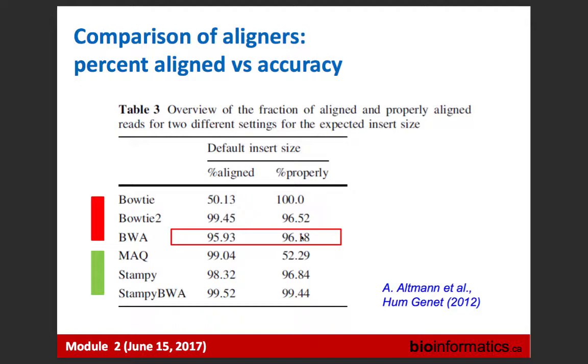I mean, first of all, there is an absolute number. You know the length of your genome. If you work with C. elegans, you need fewer reads. If you work with human, you need more reads. And then you can roughly calculate your coverage.